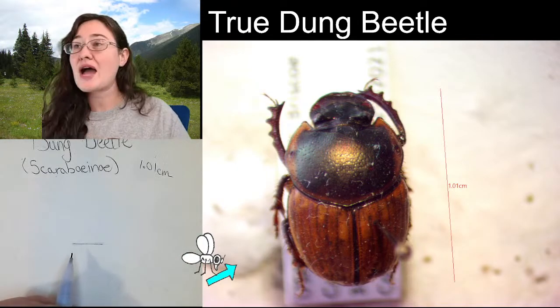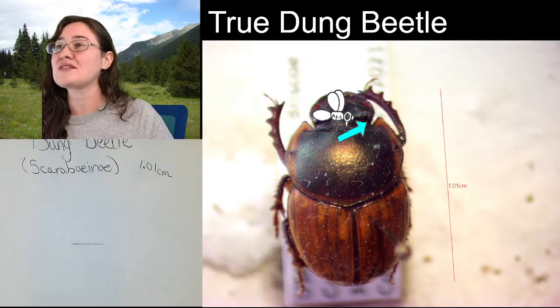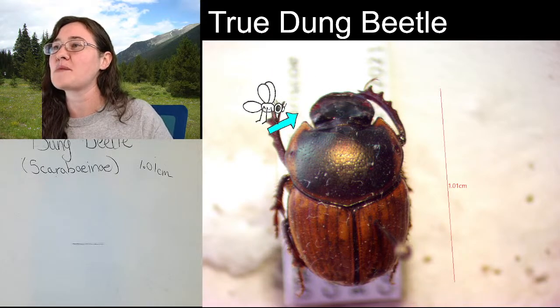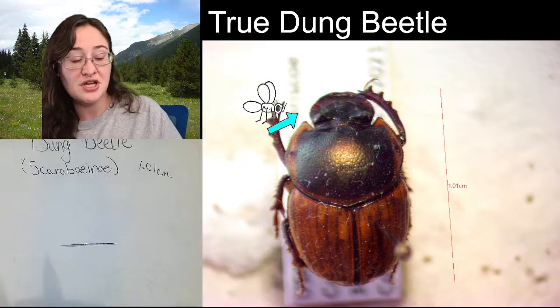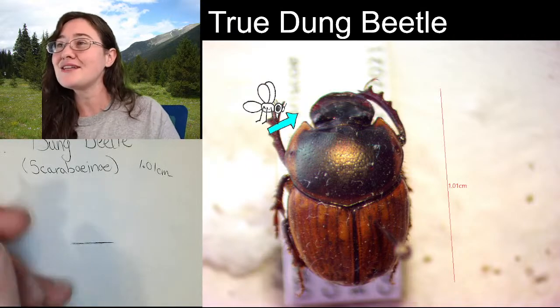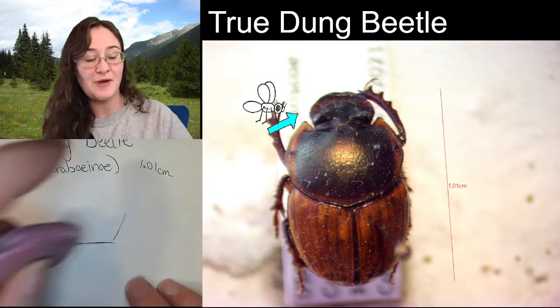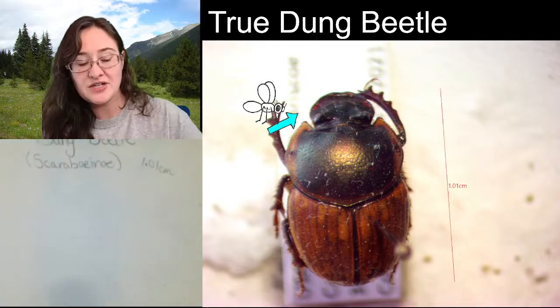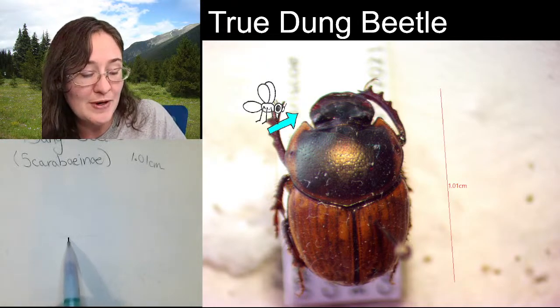All right, so I'm going to start this head. I'm going to start this head with this line here. And keep in mind, you can see that the head kind of widens out towards the horns before coming back in. So we're going to try and get this shape on our paper. Now, keep in mind that if you are sketching along with me, you want to make sure that our first sketch is really light, because we are likely going to be erasing a good number of the lines when we come back and we zoom in and we check out our specimen. Now, I actually just remembered that I want to sketch mine kind of small, because I have this idea of adding some of the body parts around my specimen.